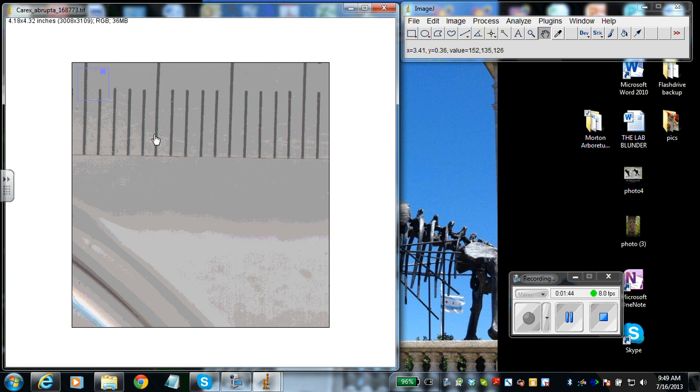Zoom in one more time here. And we're going to use the draw tool right here, use the line. We're going to start as close as we can to one side of the line, drag it across, and you can see with pixelated things, I don't know if you can see that there's little mini lines as I do a diagonal kind of vector. We want to keep it as straight as possible, so there should be no jaggedness in your line, all the way to the beginning of another centimeter line.